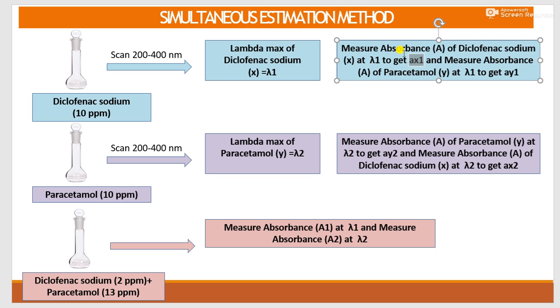In short, these two solutions are measured at both the wavelengths and absorptivity is calculated for both the compounds.